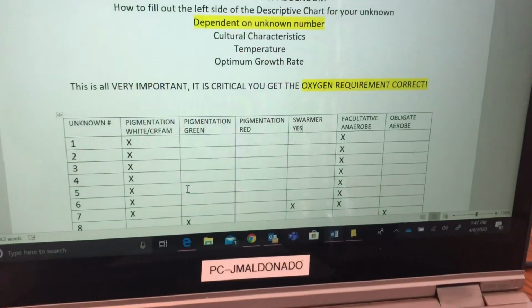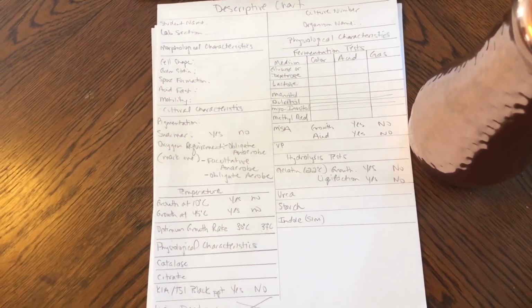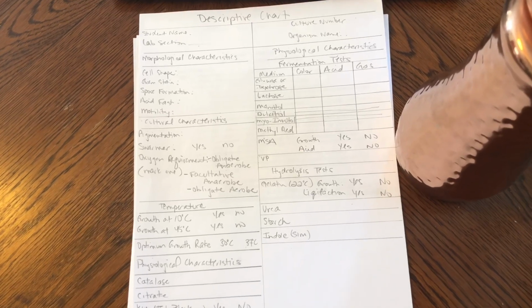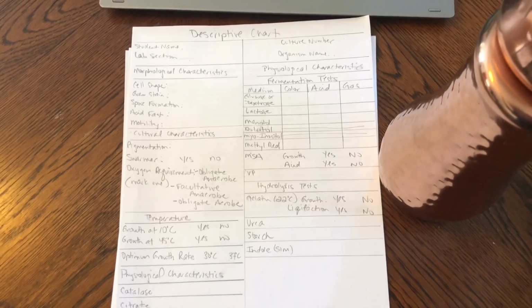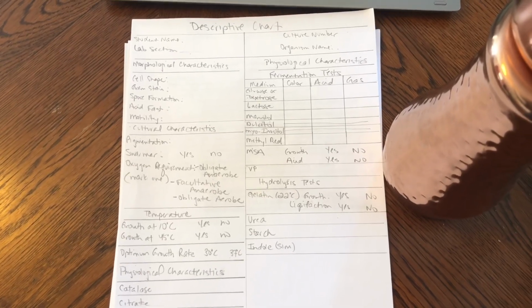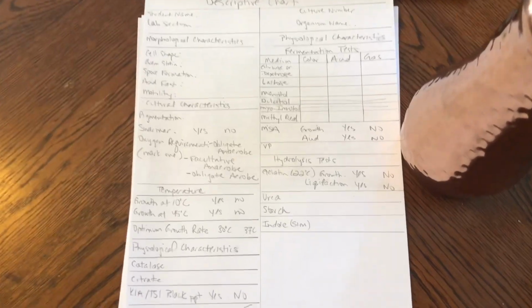And I've technically already given you the answer here, but I want you to understand what that means. That means that your bacteria could use the sugar that's there and ferment it and create organic acids or alcohol as a byproduct of fermentation, or it doesn't. It could go either way. It could be anaerobic, or it could be aerobic.